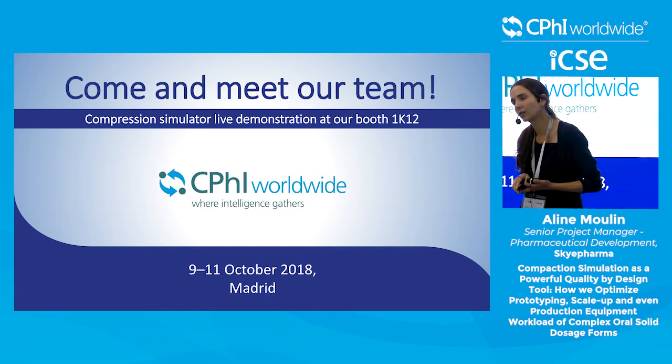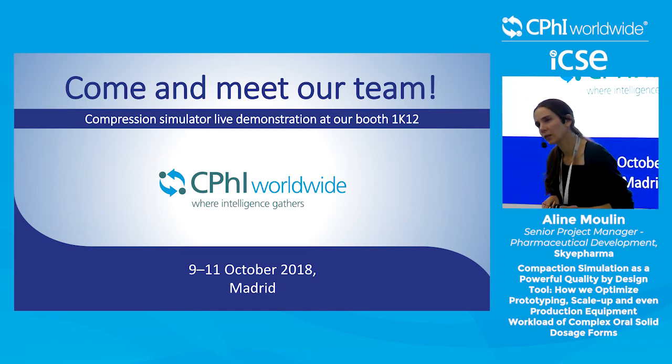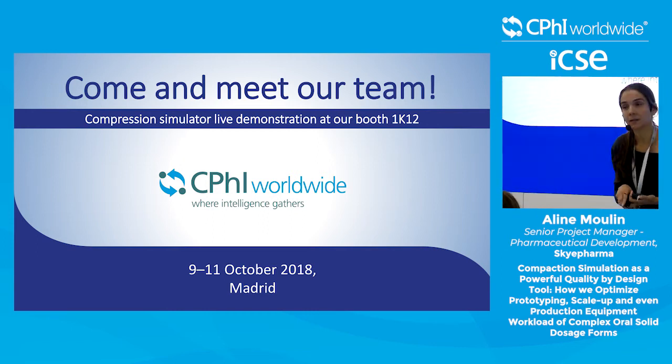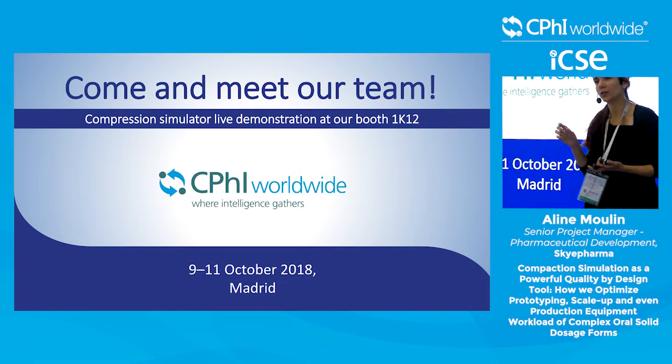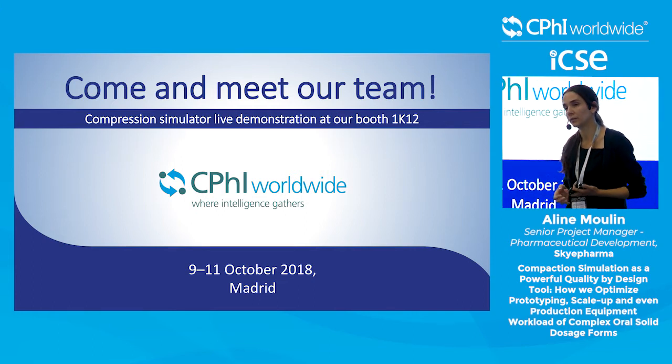Yes, and does it include pre-compression and post-compression both? Does it include pre-compression processes as well? Yes, okay, it simulates the compression cycle as a whole. So pre-compression and compression. Okay, thank you.